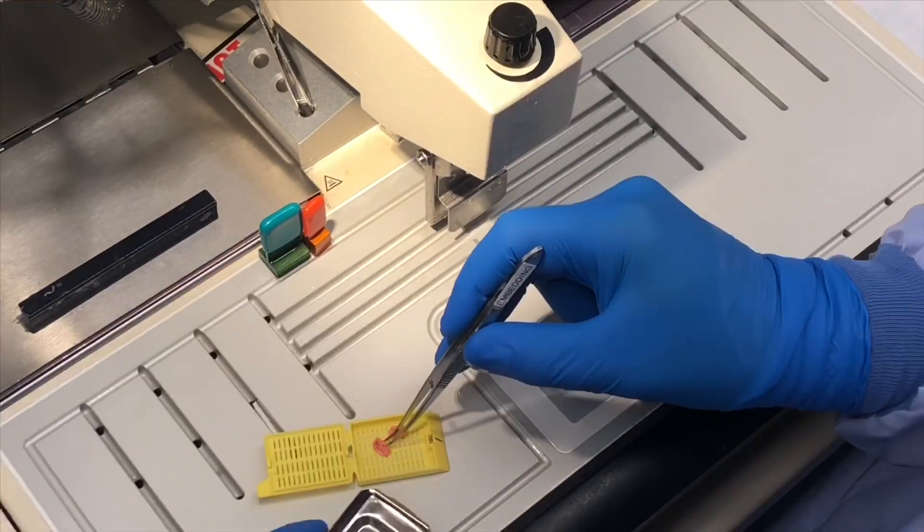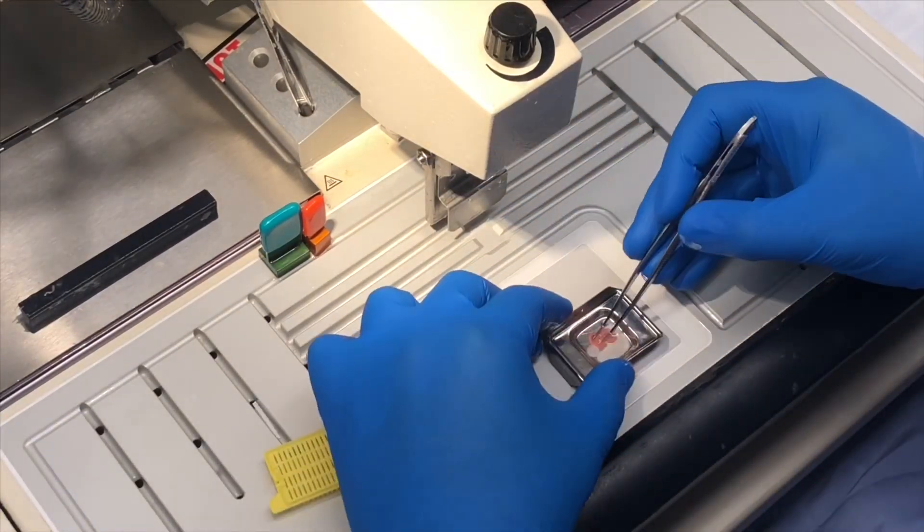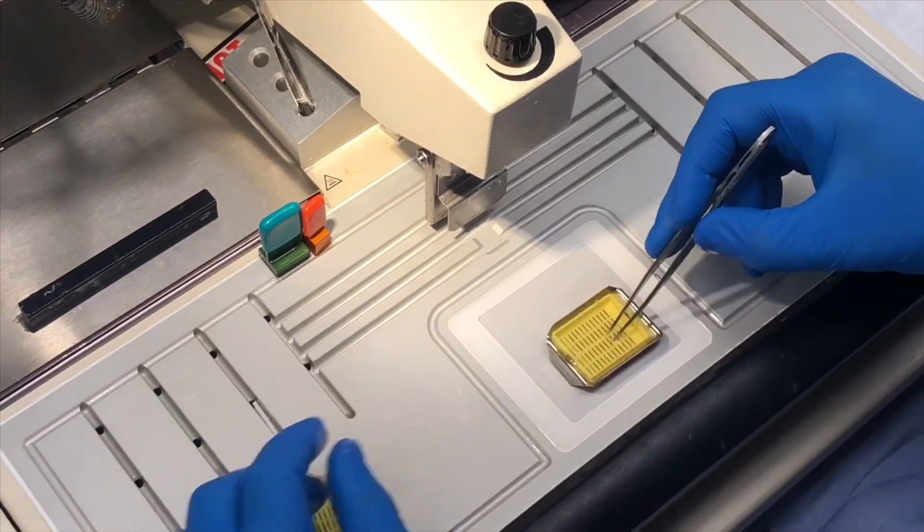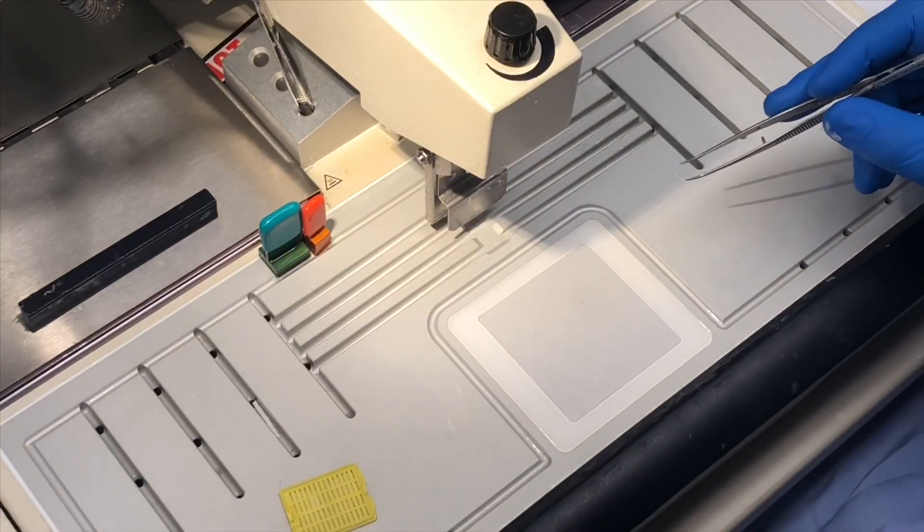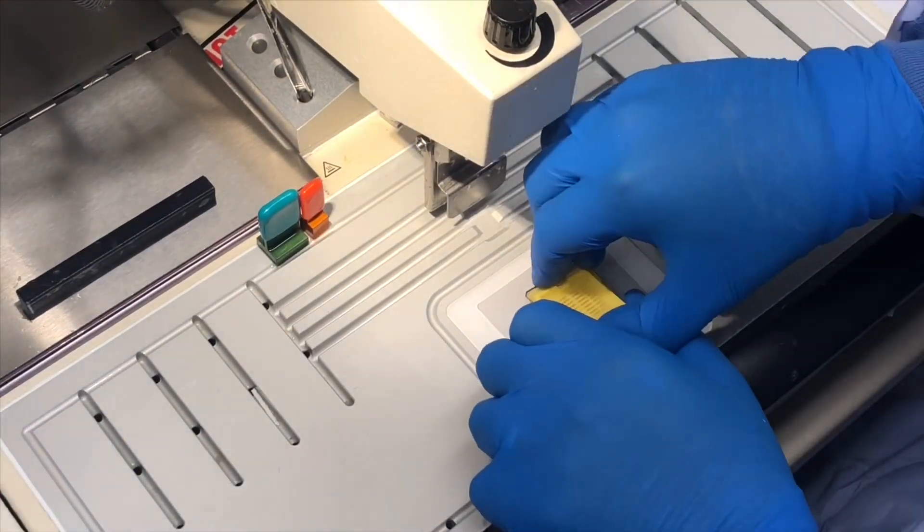The tissue is removed from the cassette and put into molten wax, and is placed onto a cold plate in order for them to chill. Once the block is cold enough, it will be removed from the mold.